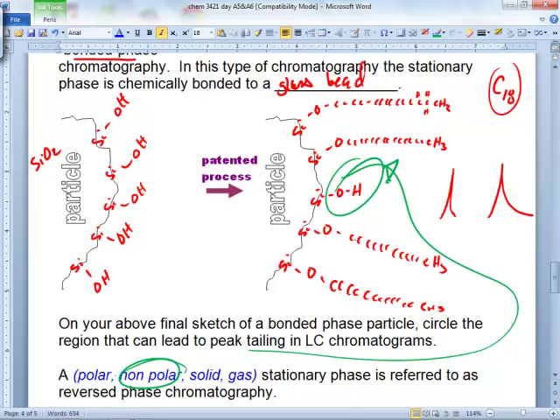And that's all we're interested in. We're all interested in these organic compounds. Drugs, every compound you're interested in nature, all these pesticides, every environmental analyses, vitamins, biochemistry, it's all organic stuff. So like dissolves like. If you want your stationary phase to interact, let's make it really nonpolar, very organic-like. A lot of carbons.